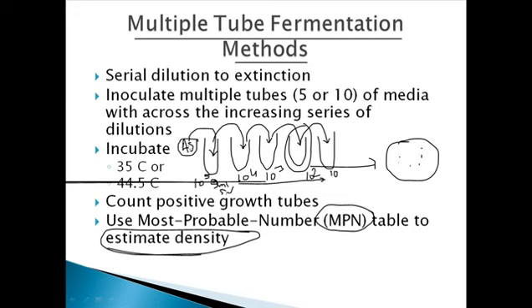If we have lots of bacteria or pathogenic coliforms in this test water, they will spoil this plate, because they will grow rapidly. We cannot count the colonies. So we need some range of countable numbers of colonies. That's why we are creating a range. We are excluding the very dilute parts, and we are excluding the very dense parts.